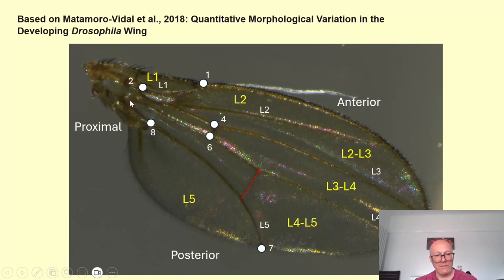Then we have this region in the middle here, defined by the cursor, which is the P6, P8. And this middle region is the P4, P6. Now, this is how I call them. Obviously, this is arbitrary, but if you call them the same way while you do your measurements, it is easier to share information. Okay, that's good.